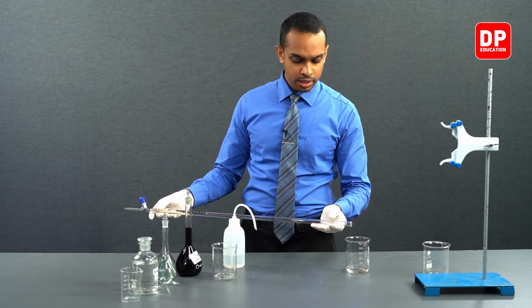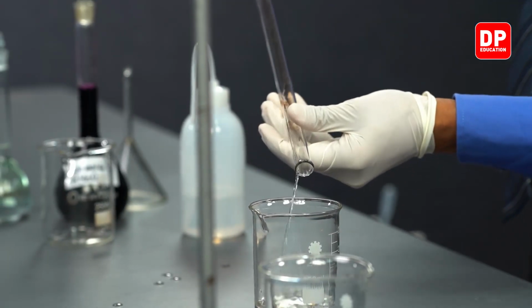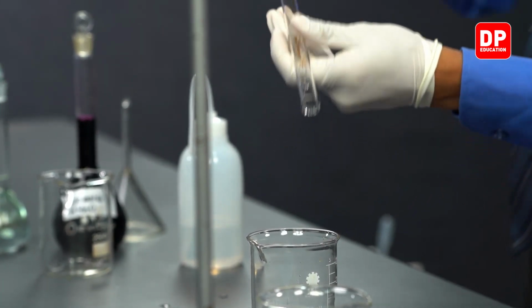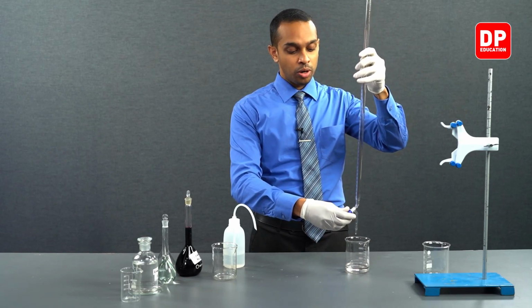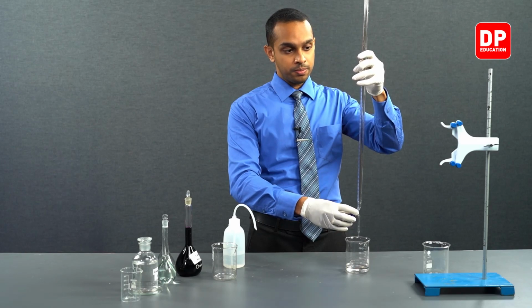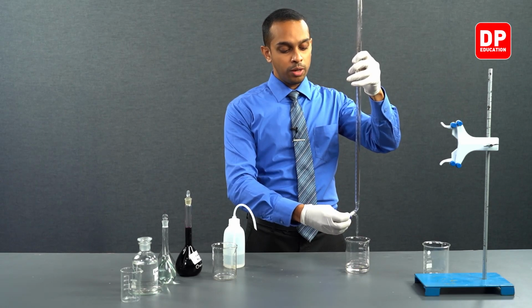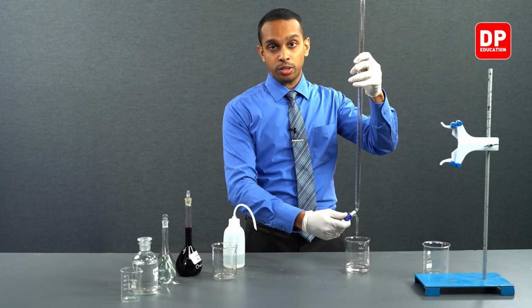While doing this, you can pour the water into another beaker to discard the water that was used to wash the burette. You can open this end to make sure all of the water in the burette is removed. So that is how you would normally wash a burette using distilled water.